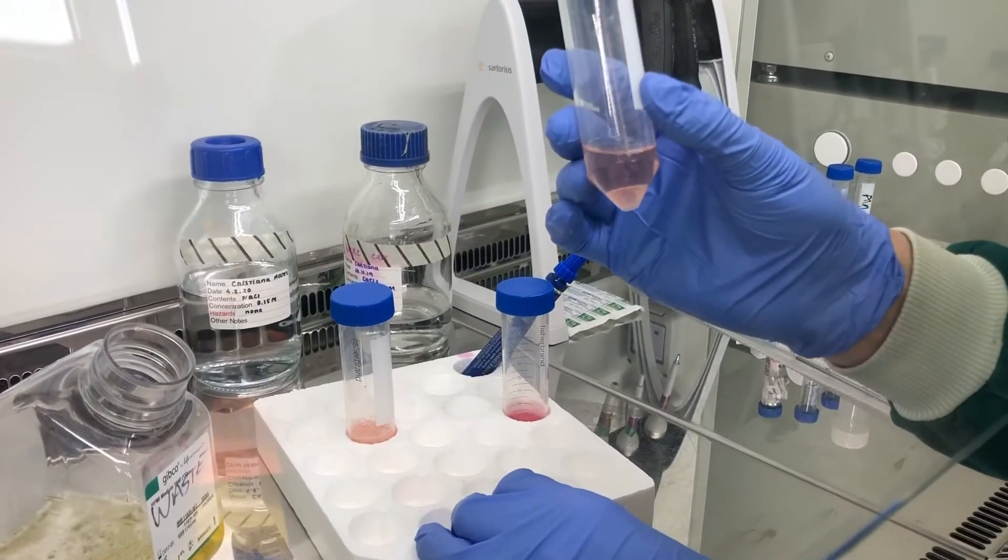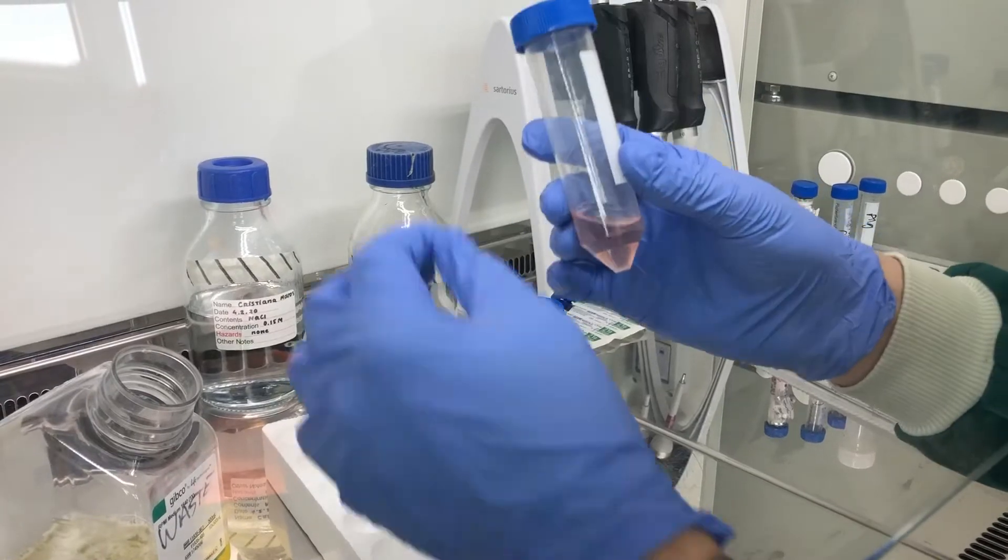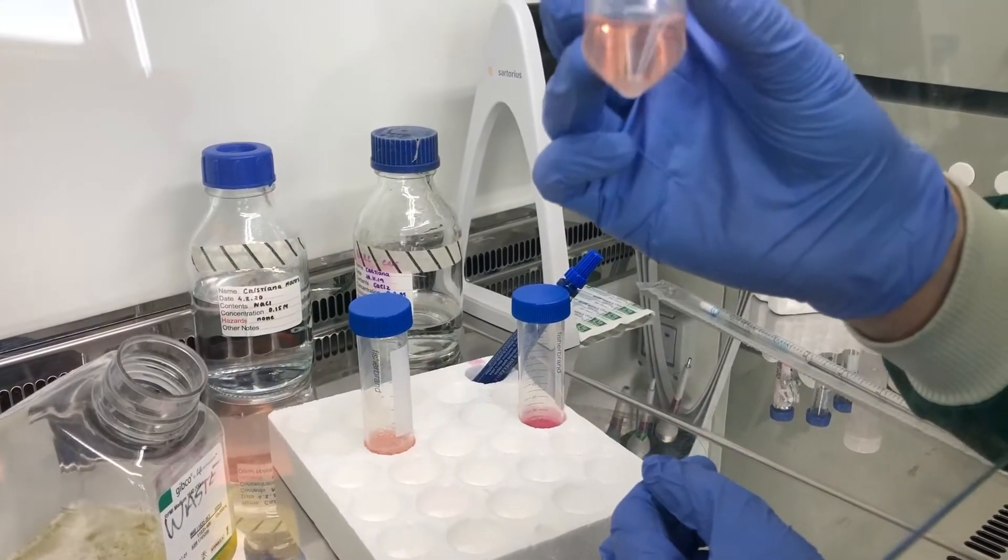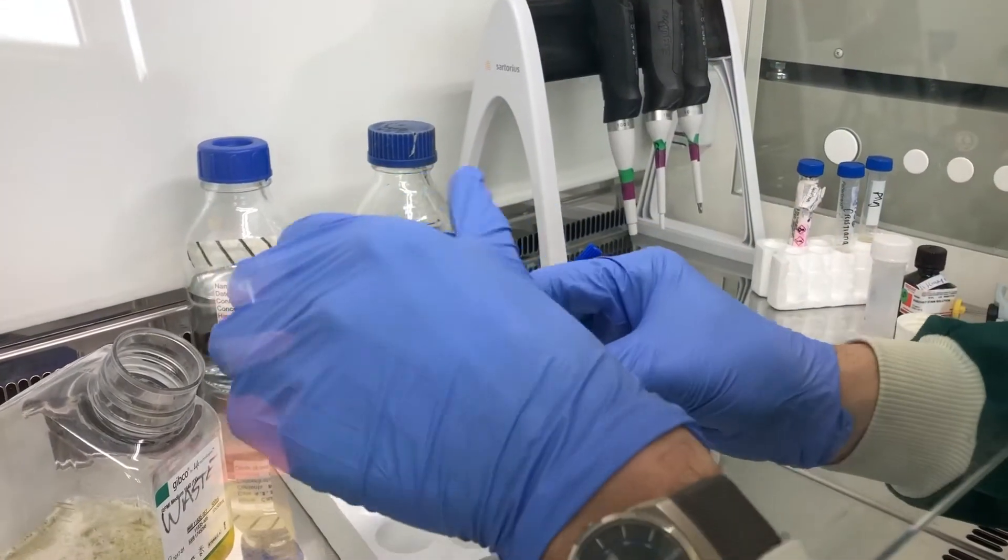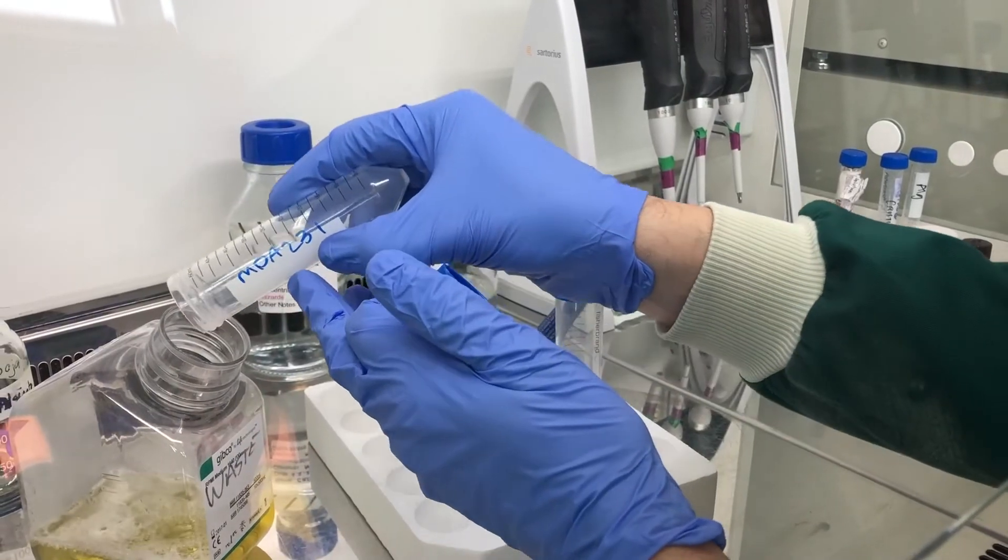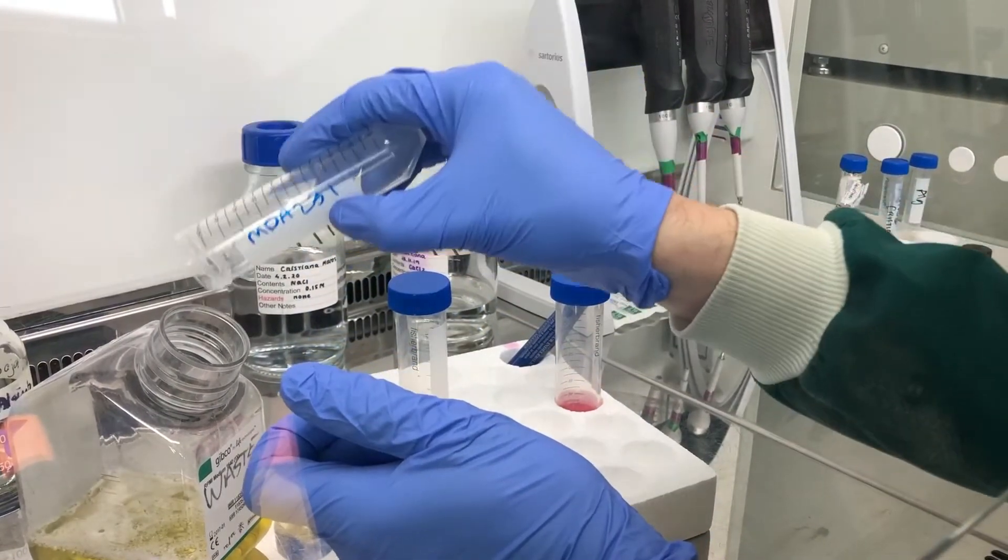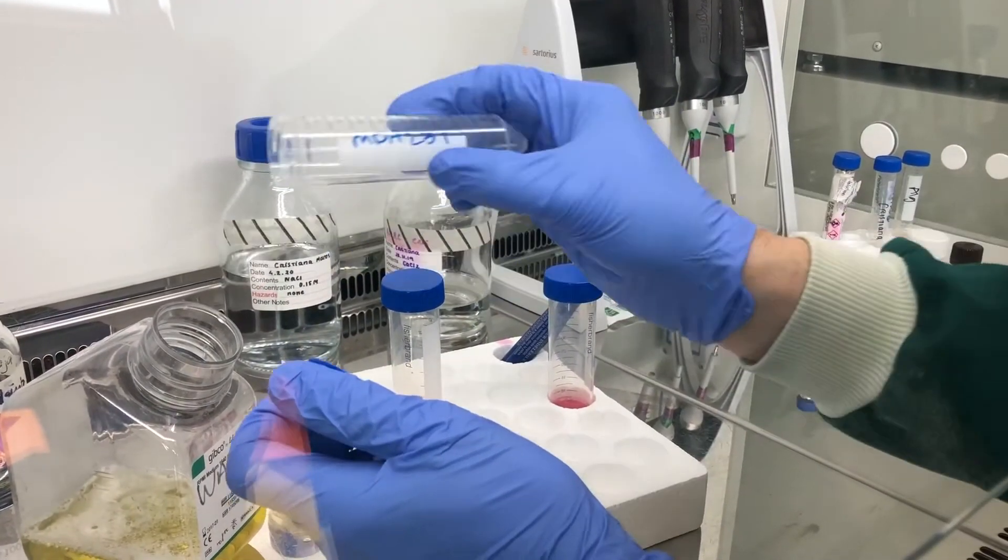Okay, so we've got probably a million and a half cells in there. You can see a little pellet in the bottom. So first, just pour off the medium. You want to get all the medium off the cells.